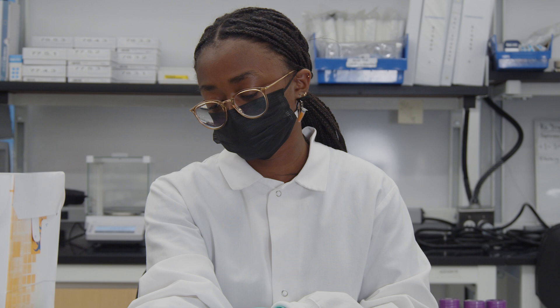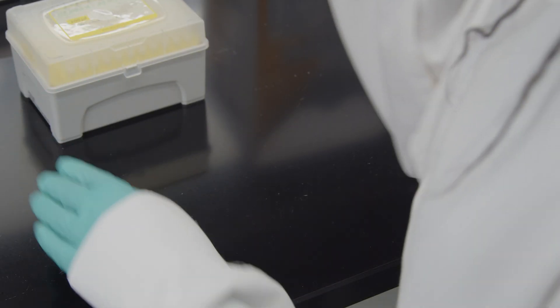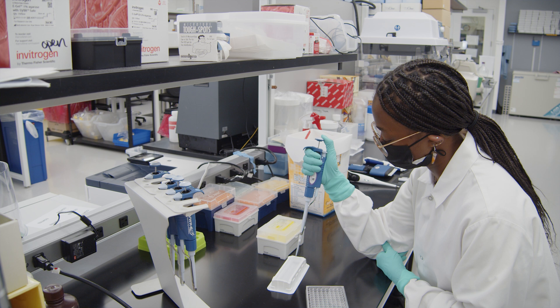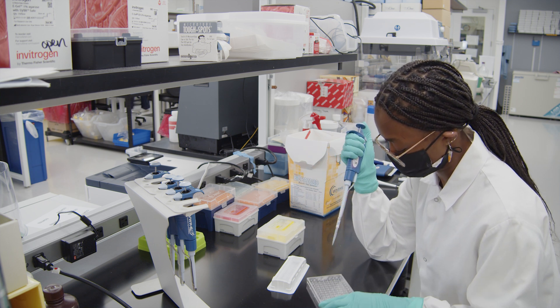But we know you're not superhuman. So we have some very useful tips on how to support that pipetting arm. First, remember you can always rest your elbows on the bench if you need to. Just be mindful of what's on the bench, so you don't spill or accidentally contaminate reagents.